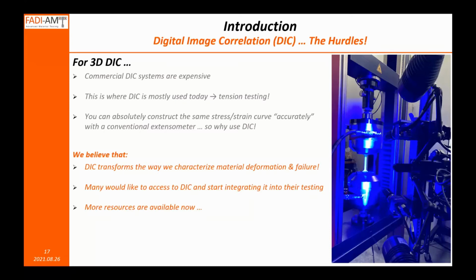And we believe that so many people would like to access DIC and integrate it into their material testing applications or component testing applications. And now is the time to do it because resources, we believe, are now more available to enable people to do that. And from that perspective, we feel one good approach, especially if we cannot overcome the main hurdle of 3D DIC and its price, is to go with 2D DIC.